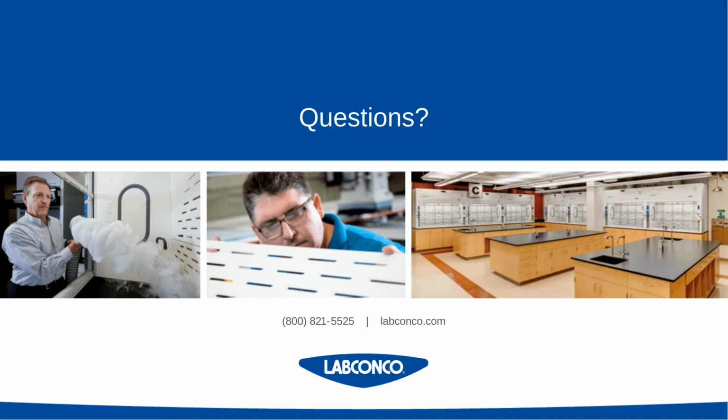It's a good question. Great, thank you, Kasey. So our next question for you is, how does the required minimum air changes per hour for the laboratory affect the decisions on the best fume hoods to install?